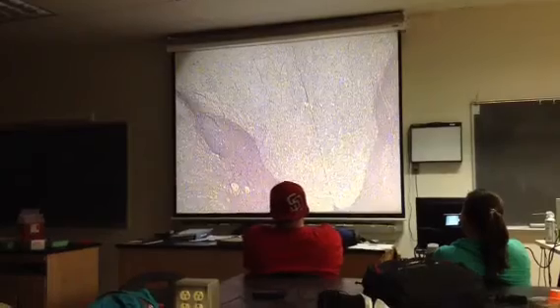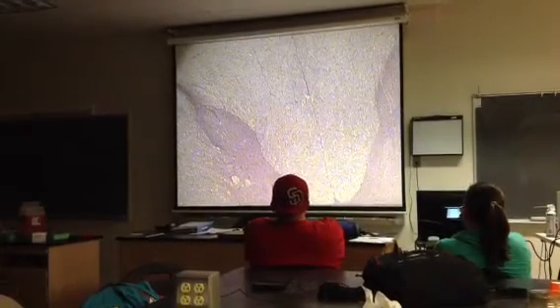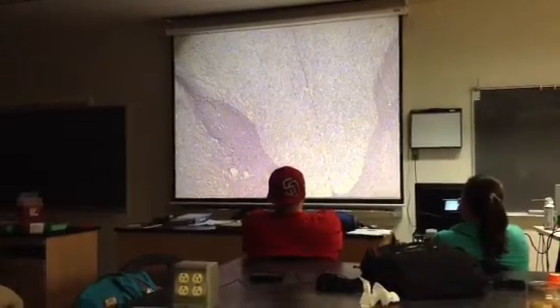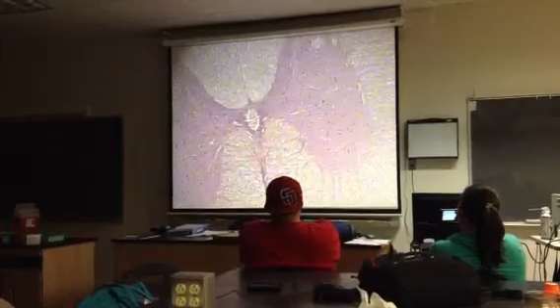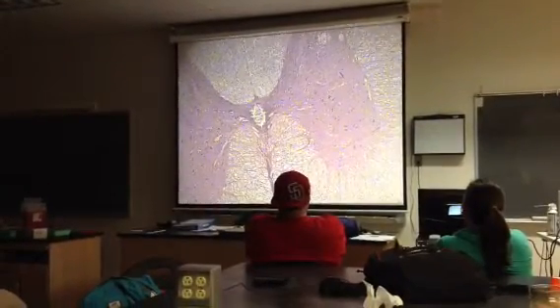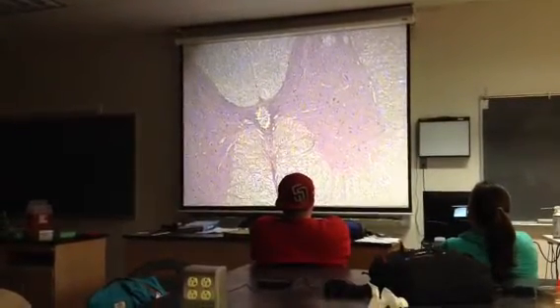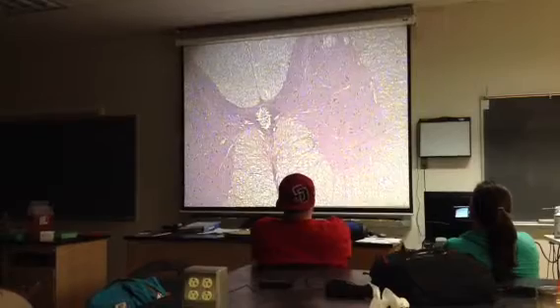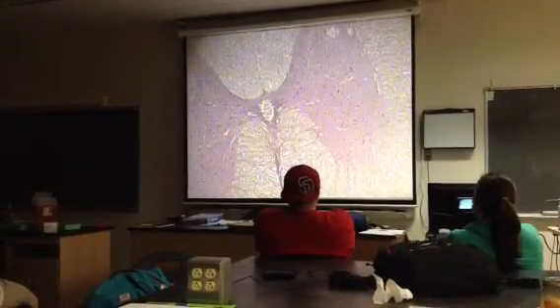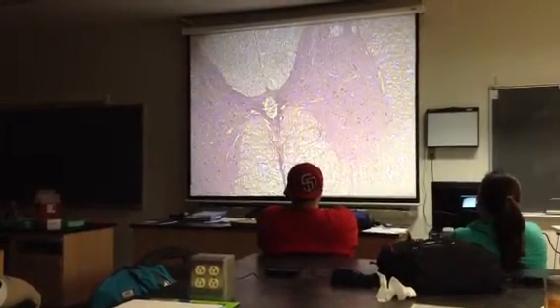All right, is this gray matter or white matter? White. Good, and what's the dominant structure in there? Myelinated axons, yeah. Okay, and then this is gray matter. And in here is lots of neuroglial cells, and what's the other dominant structure in there? Somas, yeah. So lots of neuroglia and lots of somas. If you looked in there, you may have just seen what looked like a web of stuff. That's the neuroglial cells, and then the somas are in there too.